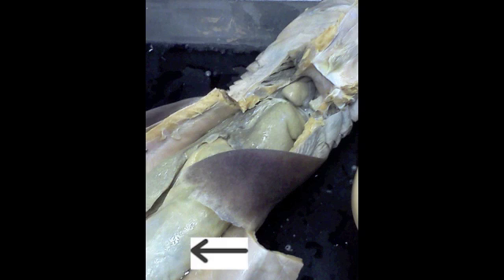In the shark and the pig, food travels from the mouth down the esophagus, which is a thick, muscular tube extending from the top of the cavity, connecting the oral cavity and pharynx with the stomach. The shark's stomach is J-shaped with rugae. Rugae are longitudinal folds that help turn and mix the food with digestive juices. The pig's stomach also has these rugae. At the far end of the shark's stomach is the pyloric sphincter, which allows only digested food to pass into the intestine. The pig also has this regulatory valve.